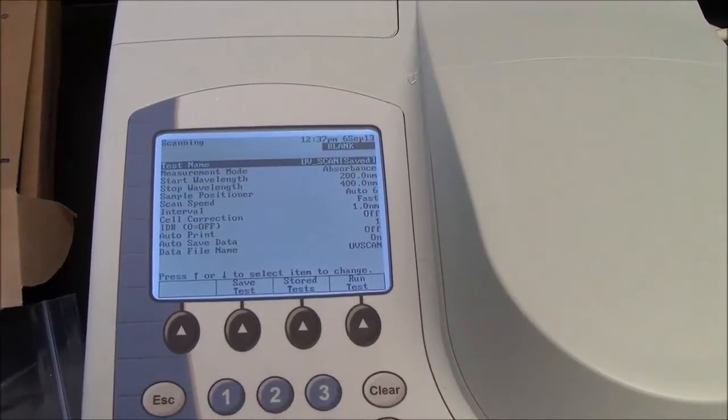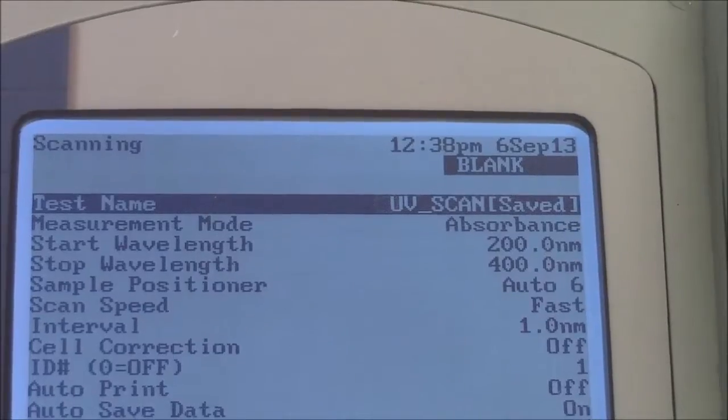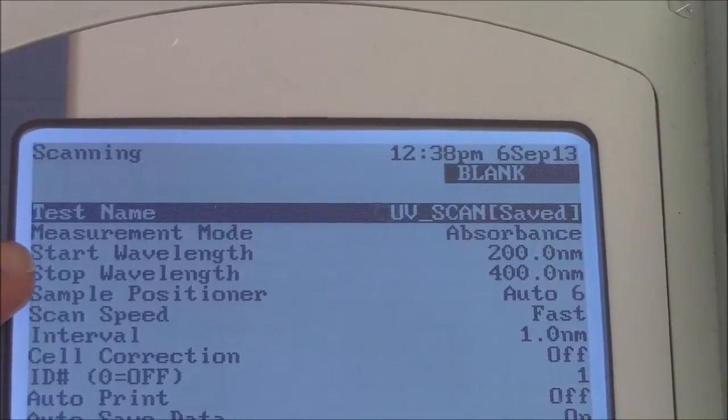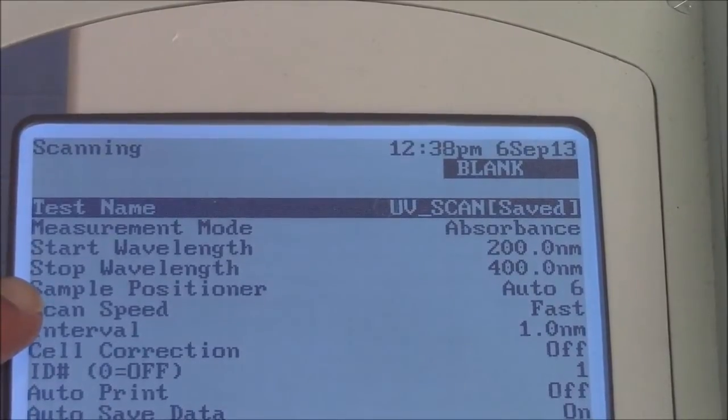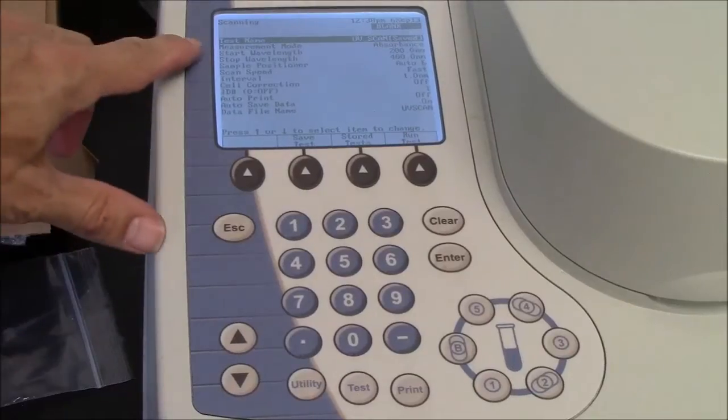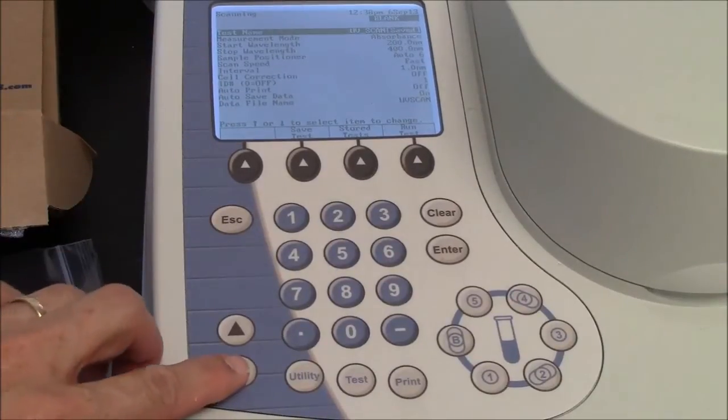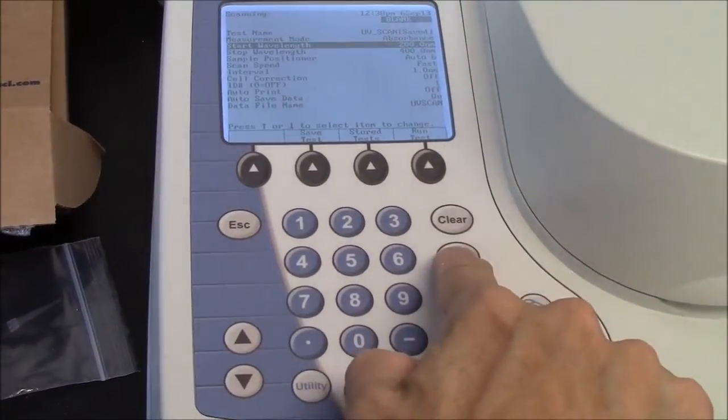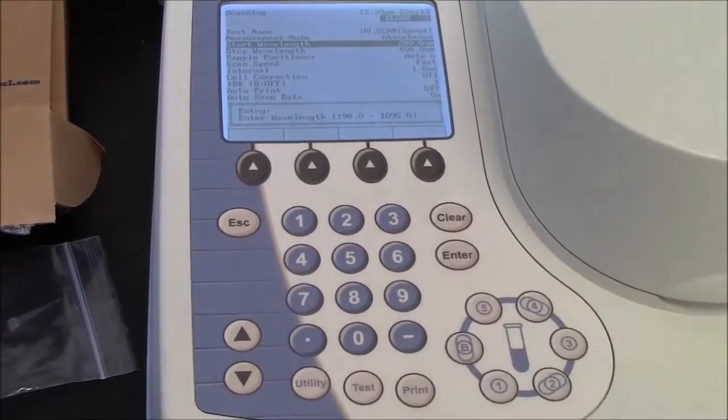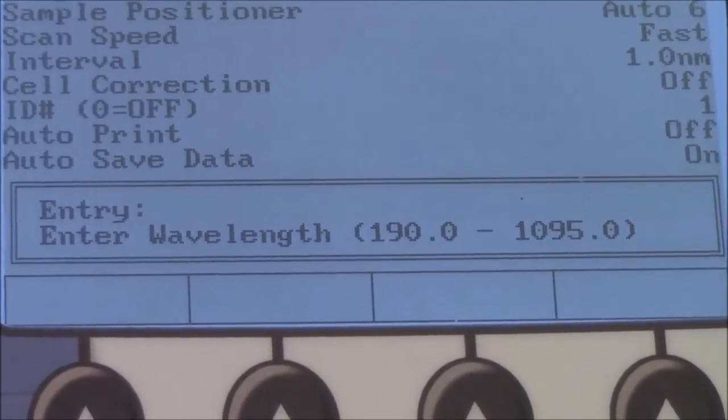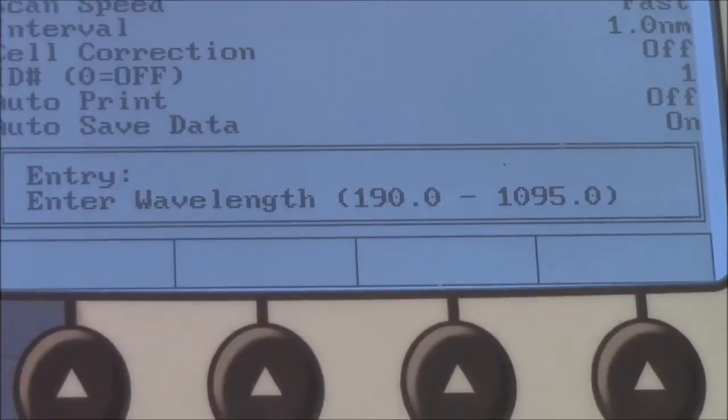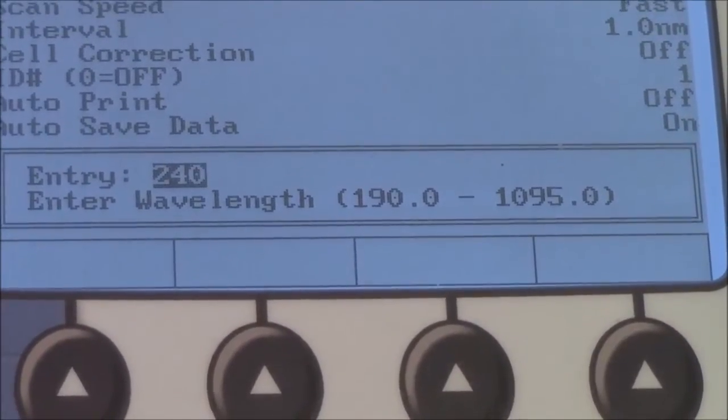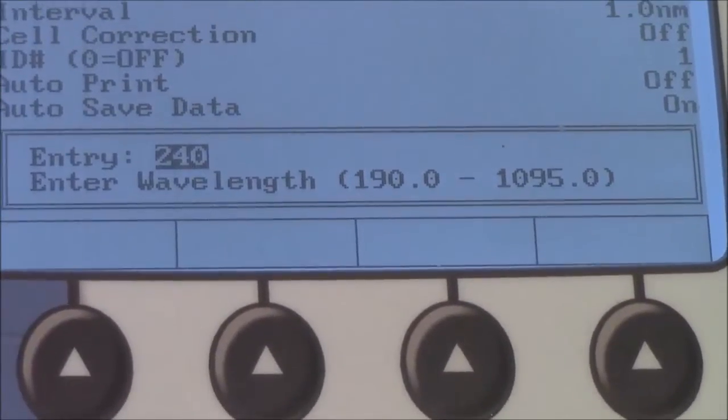And that takes me to a number of parameters. As a beginner, the only things you would really change is the wavelength range. Where do you want to start, and where do you want to stop scanning? To select the start wavelength, I have to use these arrows here. And I will press the Enter button. And now it asks me, what wavelength do I want to start scanning? So in this case, I'll say 240. So I'm just using the number pad to say 240, and that's nanometers. And I'll hit Enter.